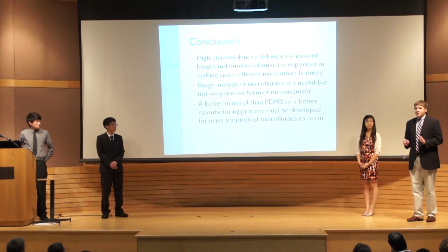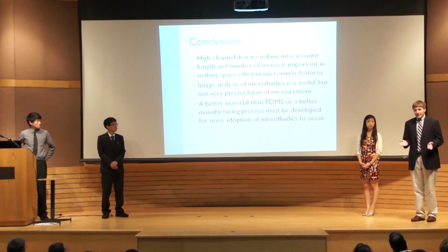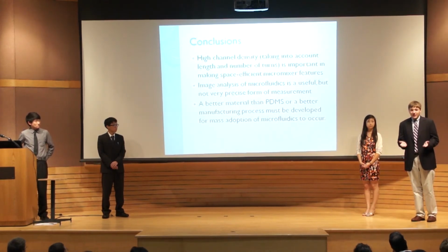And finally, due to many headaches we had in actually setting up the device, we think that a better material than PDMS or a better manufacturing process for these PDMS devices needs to be made in order for wide-scale adoption to occur.